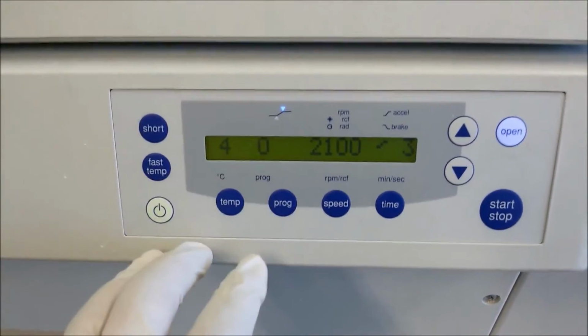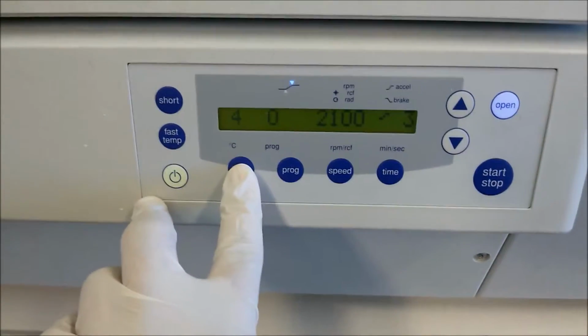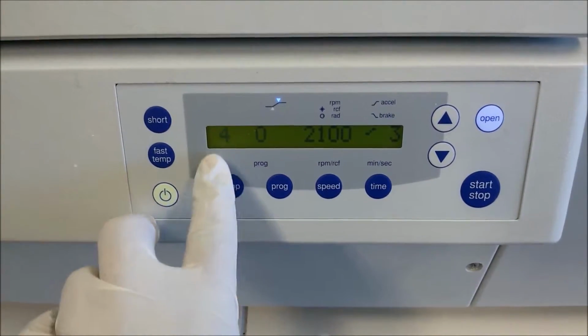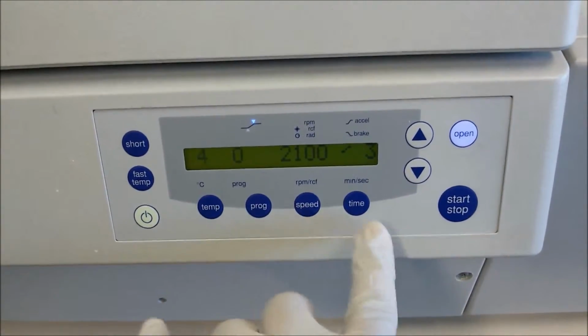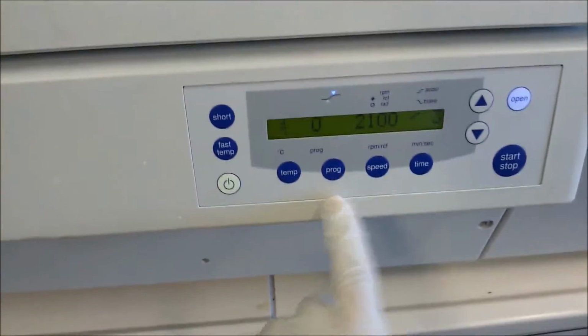So again, as you can see it here, this is a 4. You can also have a temperature knob here with the speed and time. Don't worry for this program because it's not important here.